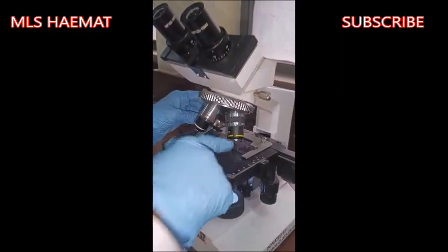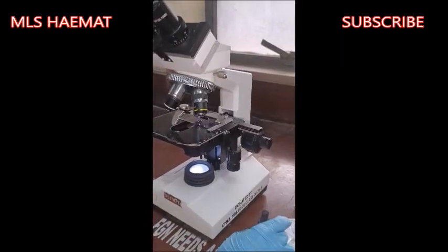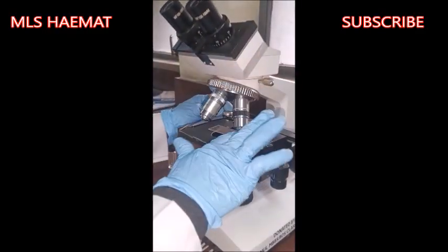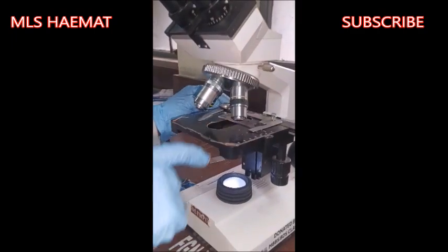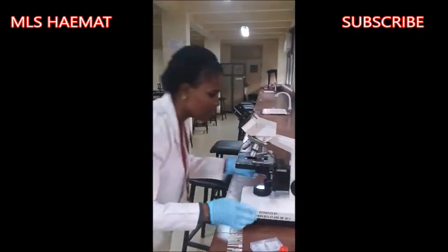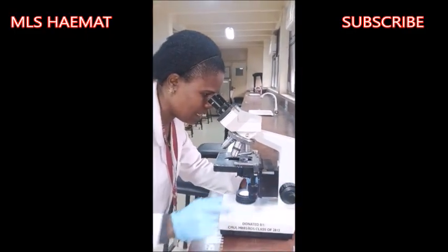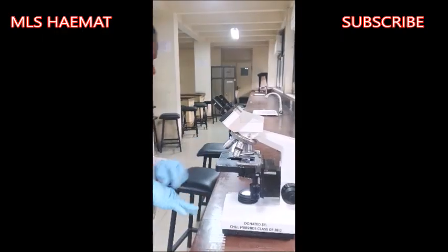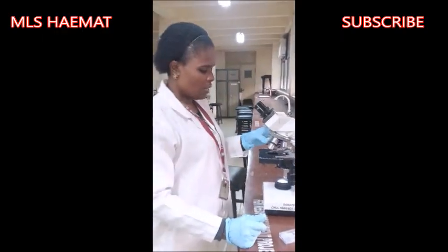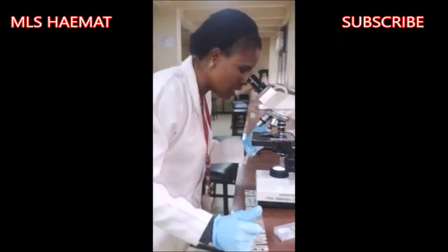So for me to do that, I'll wrap down the stage with the coarse adjustment, and then I'm starting with the ×4 objective lens, which is the scanning objective lens, just to be sure that there's something on the slide. Yes, and I can see that clearly. Now it is in focus with the ×4. Now let me change it to ×10, which I have done.